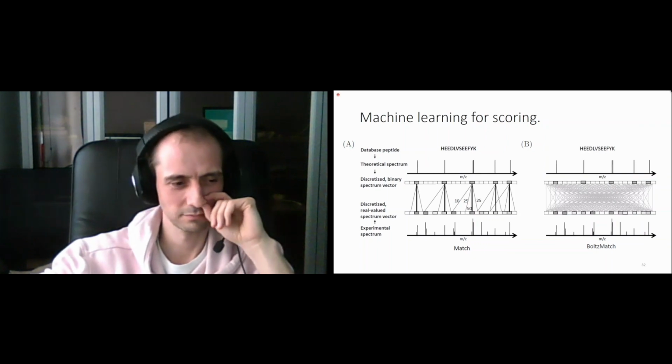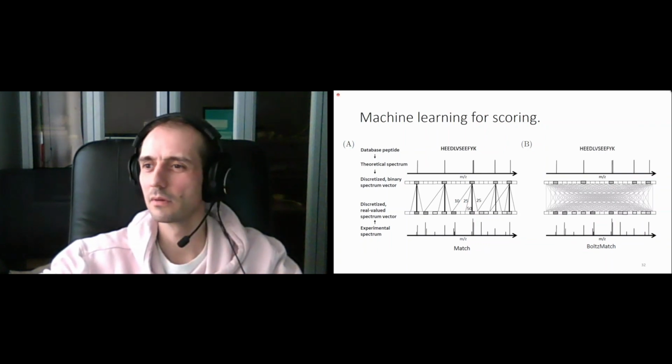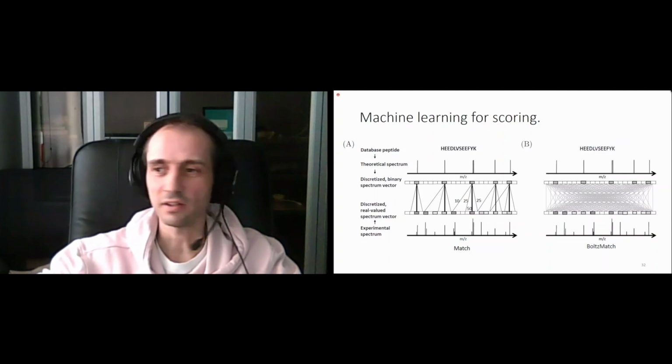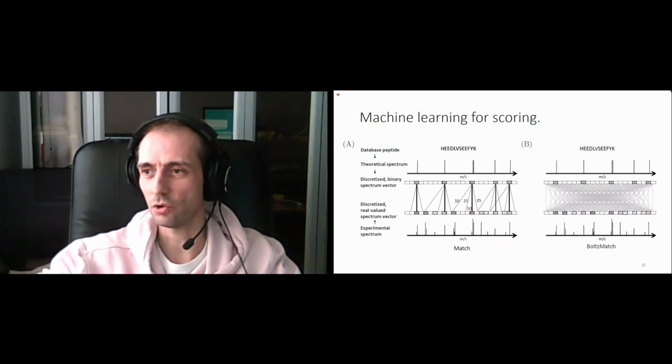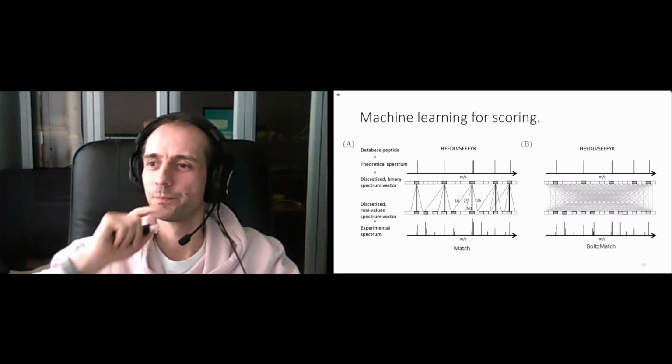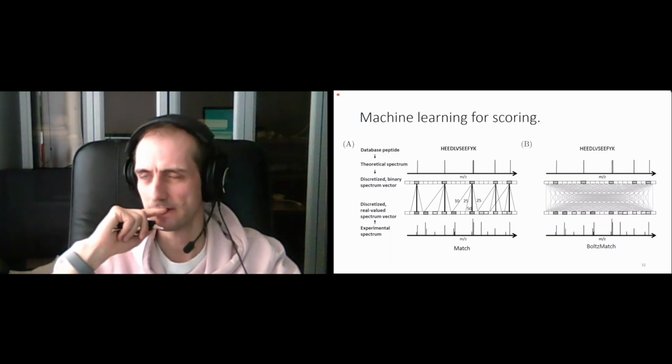So what is the goal of the research then? I assumed it was to provide the user with better algorithms to understand the data better. Yes. Yes, but then he needs to train a model himself on some data. Yes. So let's suppose next year someone creates a new instrument, then the model needs to be trained on that instrument. Yeah, so he needs to collect data on this instrument first.